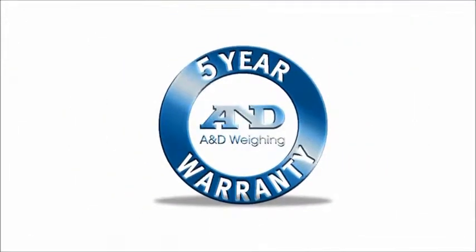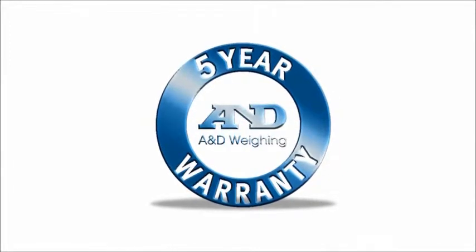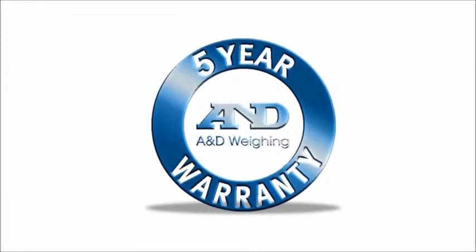The ION series is backed by A&D's five-year warranty, the best in the industry, so you can weigh with confidence.